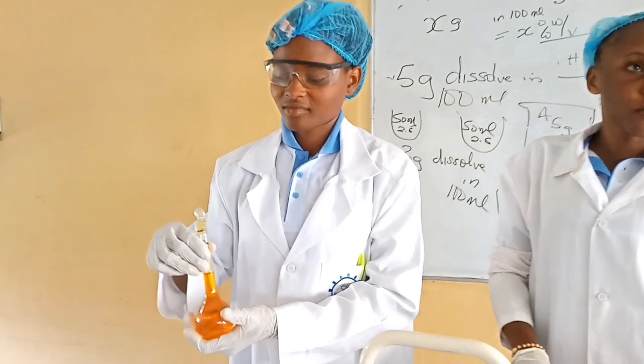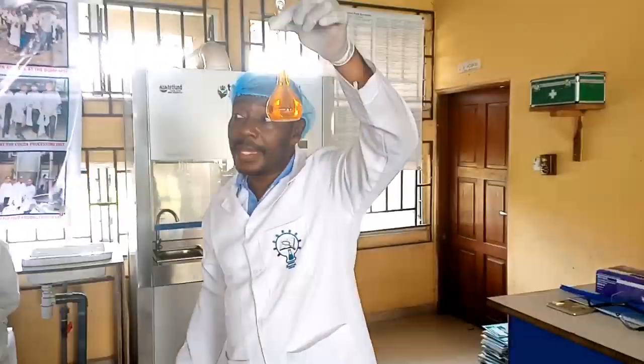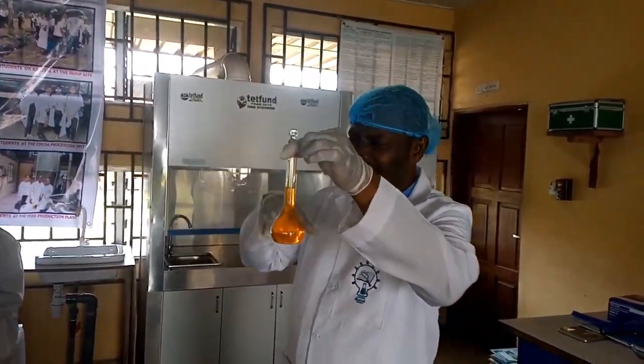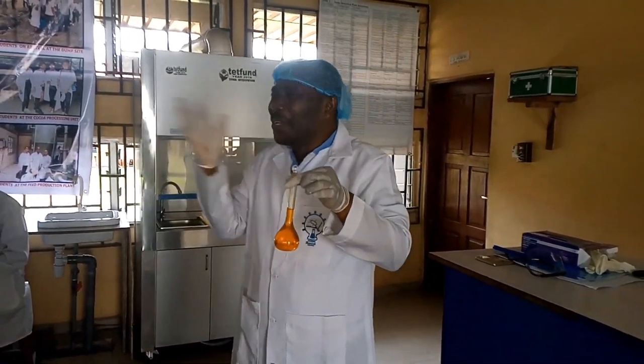So now that she has done this, she has prepared 5% solution of potassium dichromate. And this is the color of potassium dichromate. From today, if you are just passing by, you see someone having this orange color, that's potassium dichromate. But some people don't even know the color of potassium dichromate.